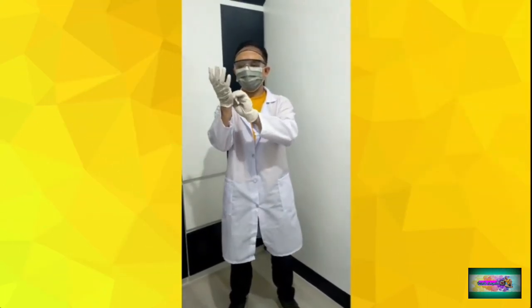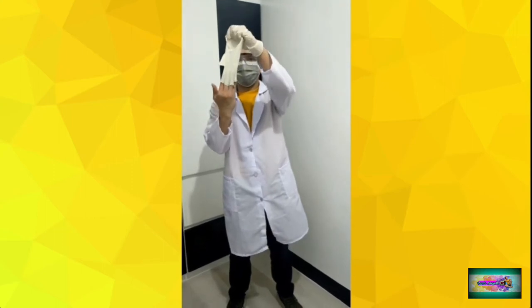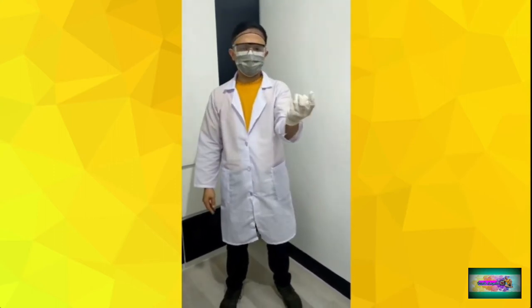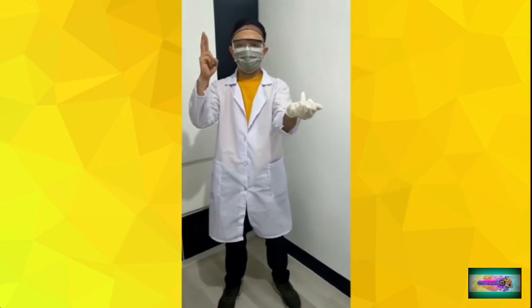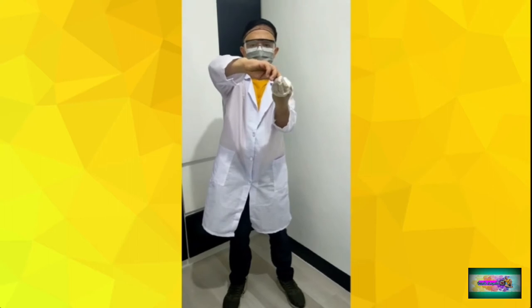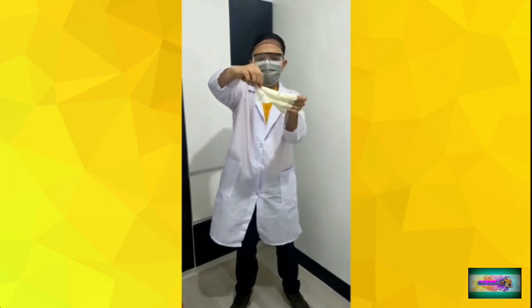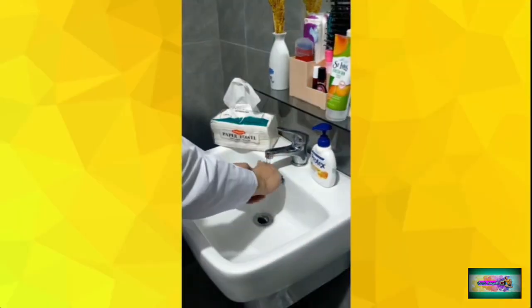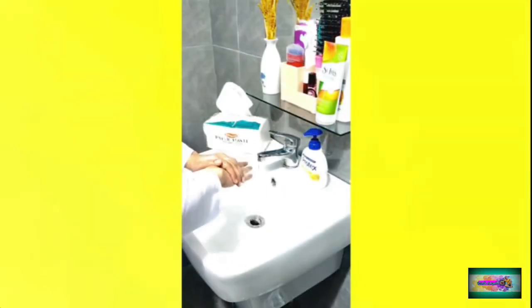For doffing, first, using one hand grab the palm of the other hand and peel off the first glove. Then take the index finger of the ungloved hand and slide it carefully under the cuff of the other glove and peel it over. Dispose of the gloves and perform hand hygiene.